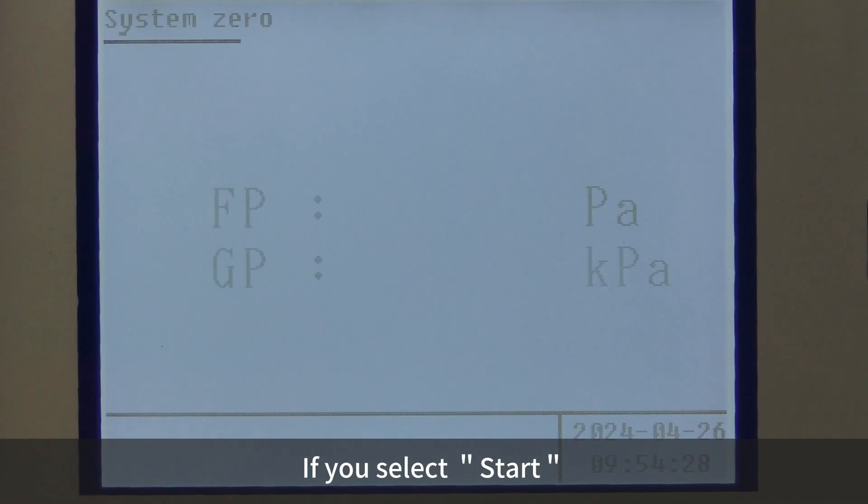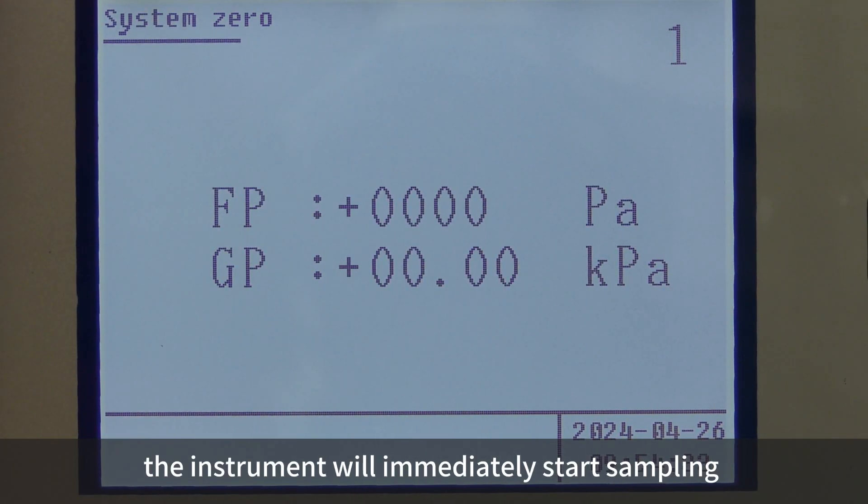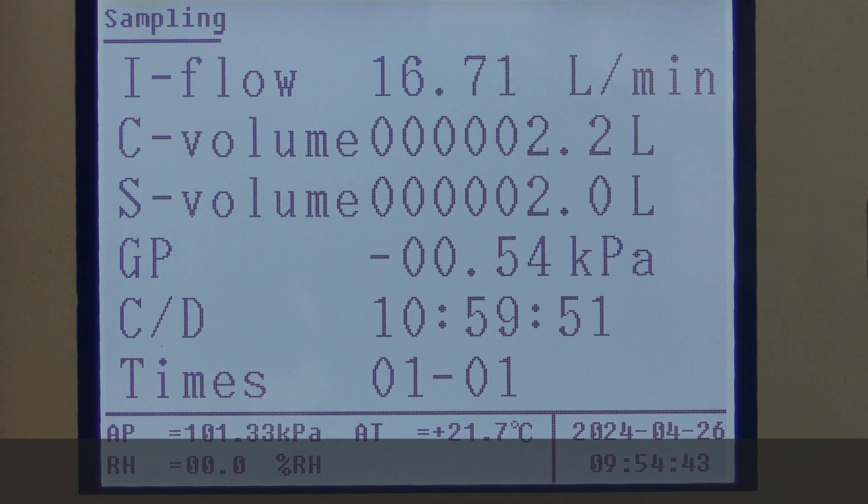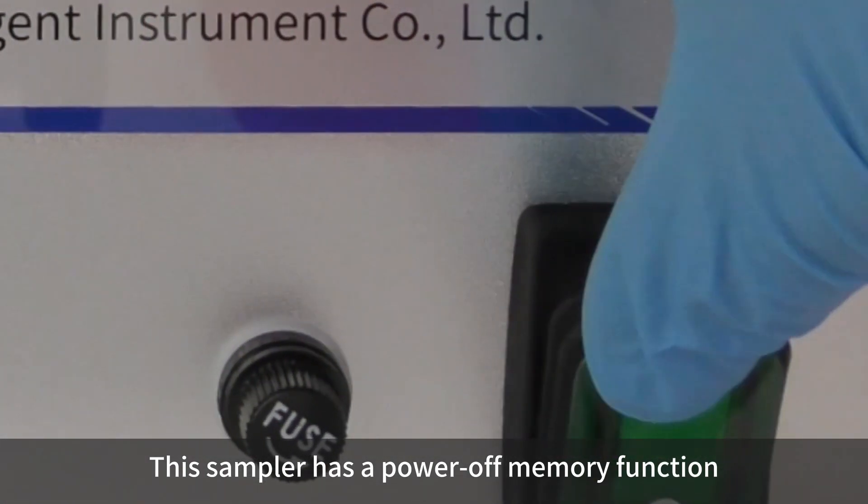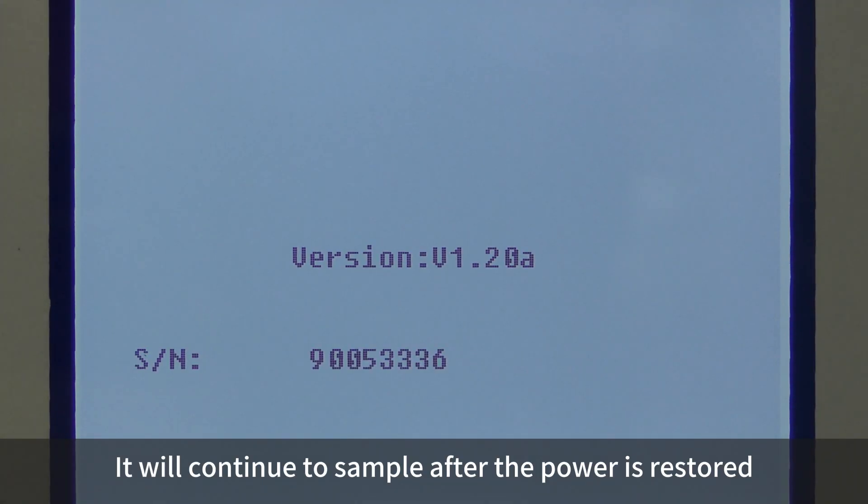If you select Start, the instrument will immediately start sampling according to the current parameter settings. This sampler has a power-off memory function. It will continue to sample after the power is restored.